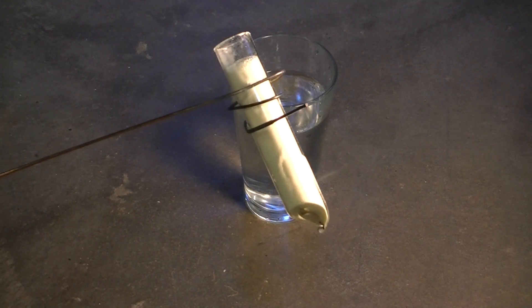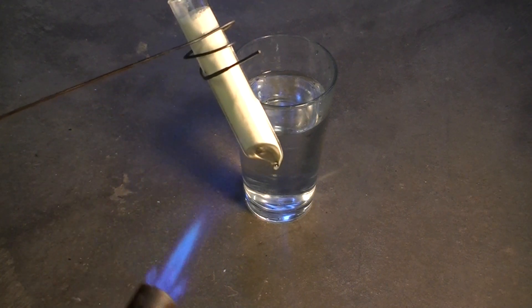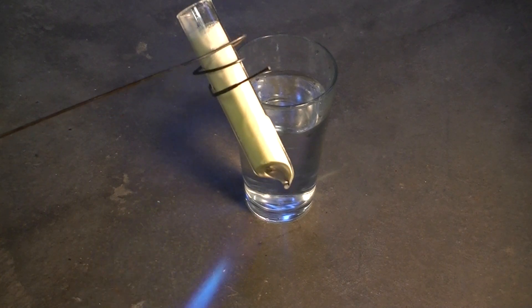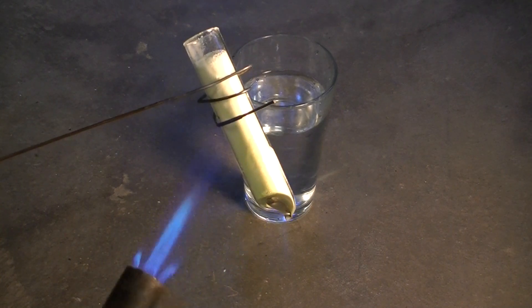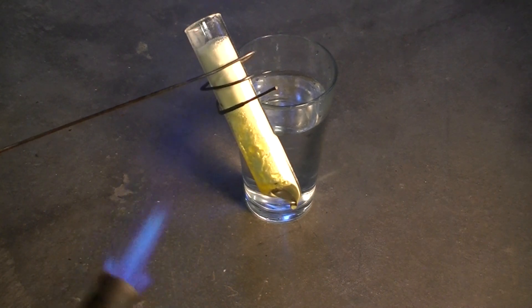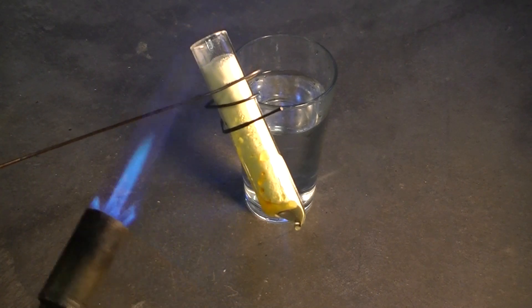In our third and final demonstration, we are going to show a unique property of elemental sulfur to form plastic sulfur. As you can see we have a large quantity of sulfur that we are heating in a test tube. Whilst this is heating, we need to discuss some of the allotropes of sulfur.